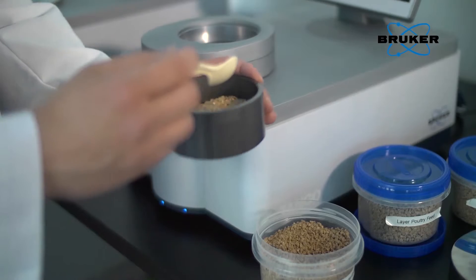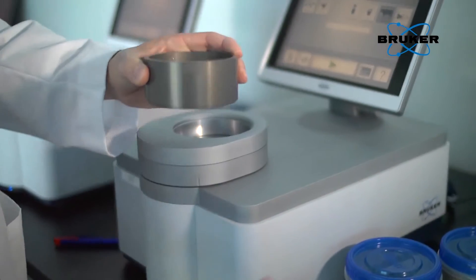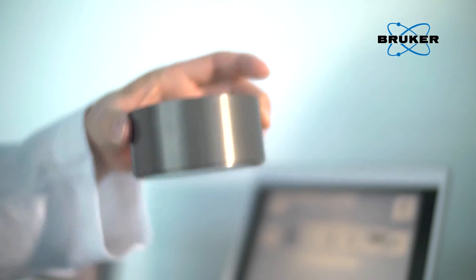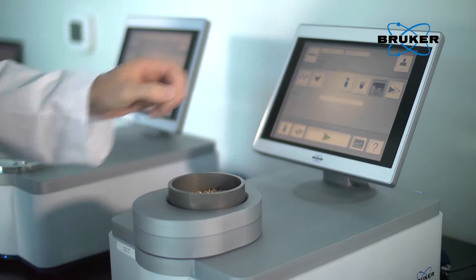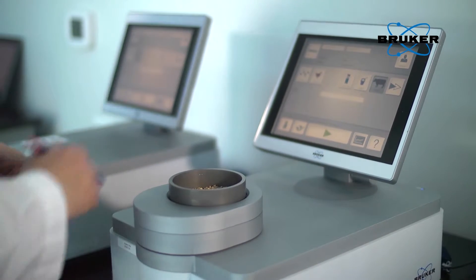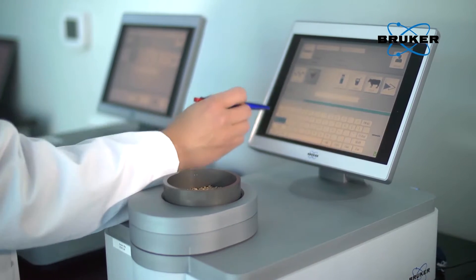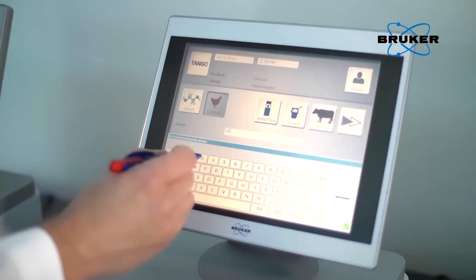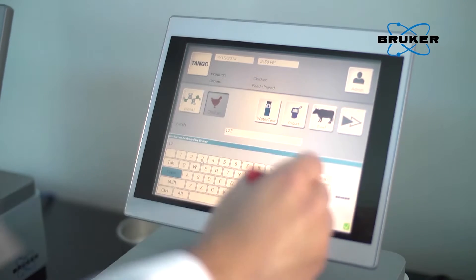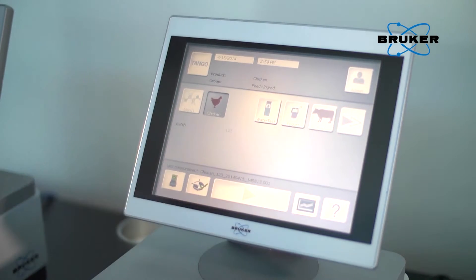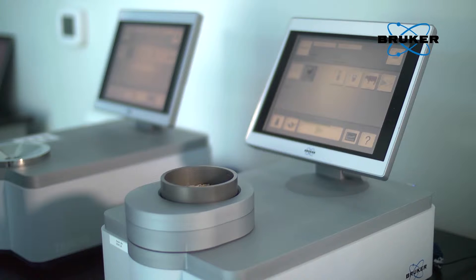The sample is simply filled into the measurement cup or sample vial and placed onto the spectrometer. The product is selected by either pressing on the respective product icon or by using a barcode reader. A simple touch on the screen starts the measurement, and the progress is displayed through the green status bar.